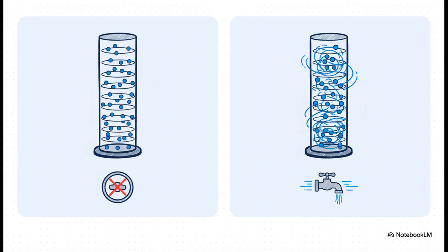So how does rate theory actually build on plate theory? Well, think about it like this. Plate theory imagines this perfect, static equilibrium on each step. Rate theory says, hold on. In the real world, things are always moving, so you never truly reach that perfect equilibrium. And maybe most importantly, plate theory completely ignores how fast things are moving.